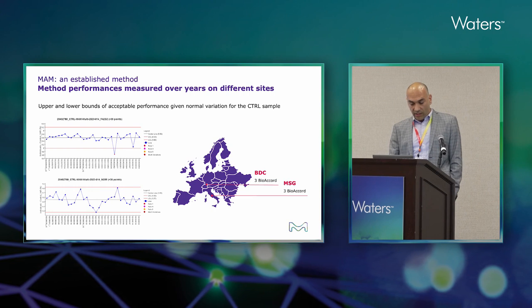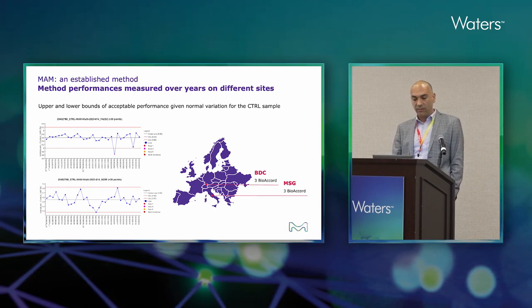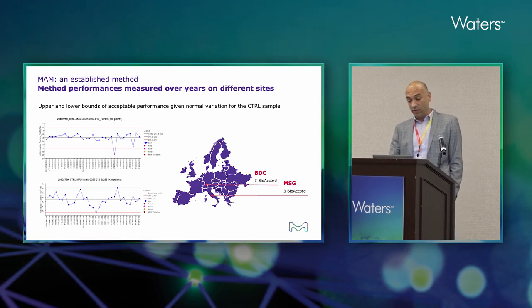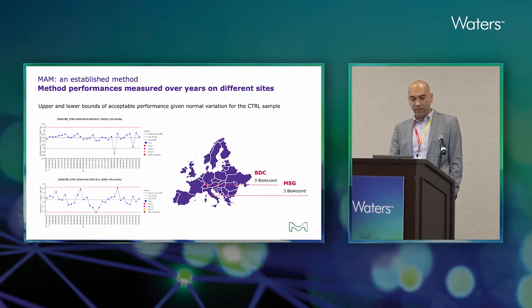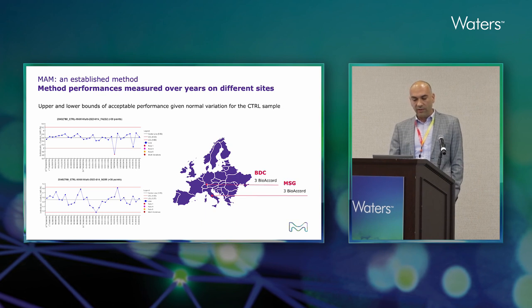I was talking about knowing the performance. It's also a matter of monitoring performance, because if you want to go into QC, you want to leave not that much space for error. So this is an example of the benefit that you can get from automated sample prep.